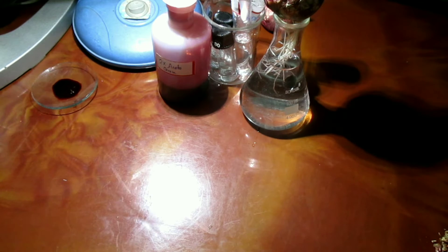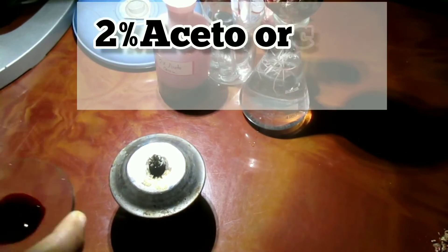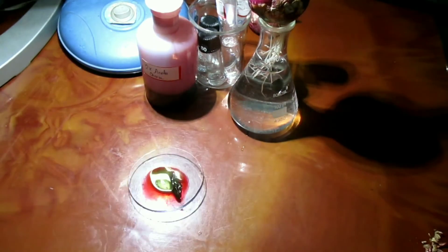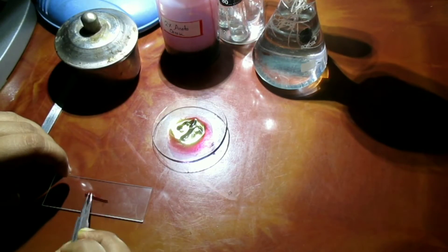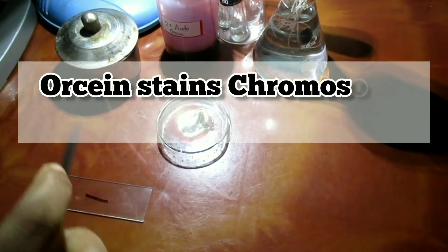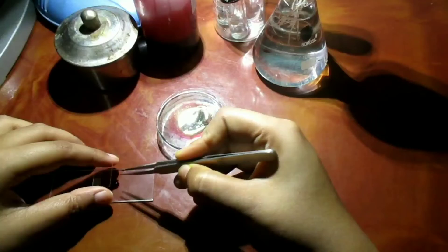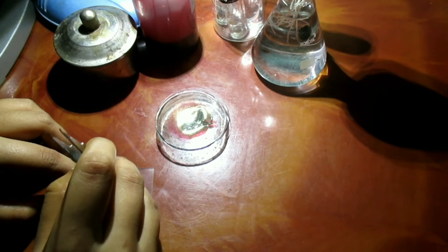For staining, root tips are gently heated in a mixture of 2% aceto-orcein and normal HCl. Orcein is a basic dye obtained from lichen. It is deep purple in color, obtained from the colorless parent compound orcinol, 3,5-dihydroxytoluene. Orcein stains the chromosomes and HCl dissolves the middle lamella. Pressure is then applied; the cells separate from each other and form a single-layered smear. Heating quickens the staining.